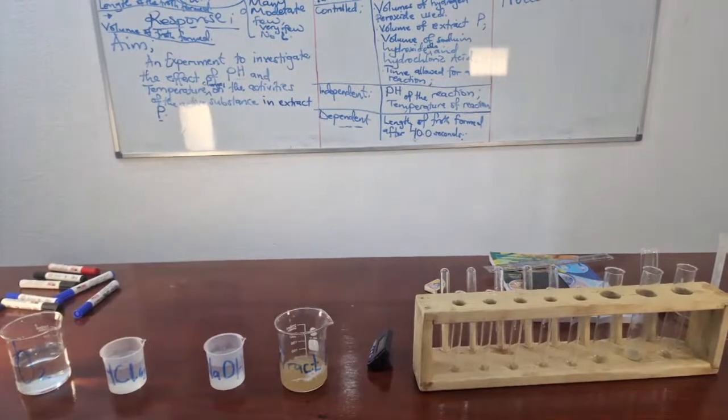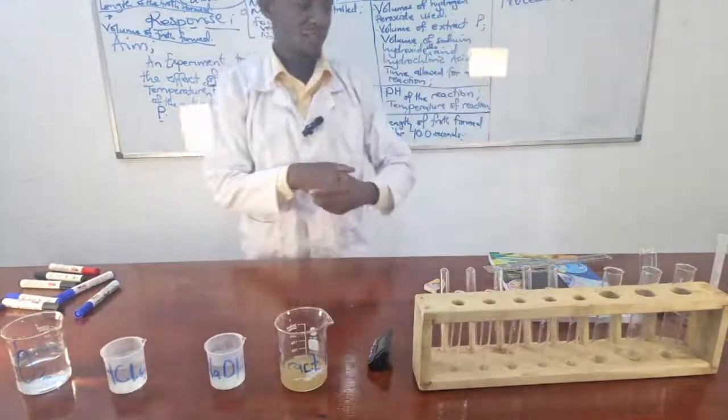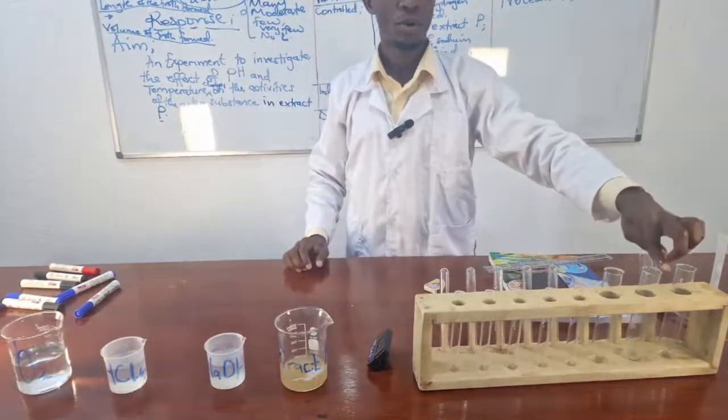I'm putting the stove off. So we have a boiled sample here.